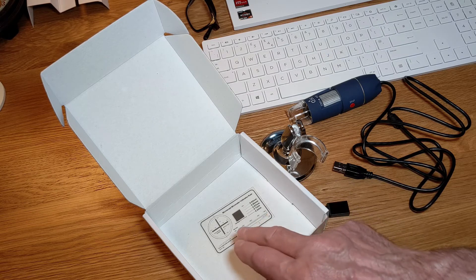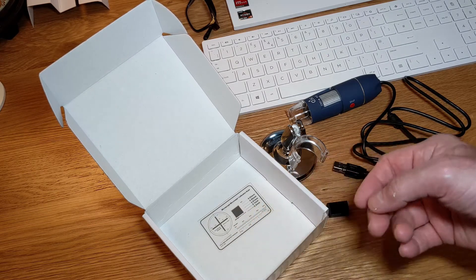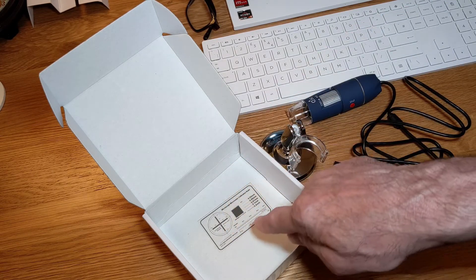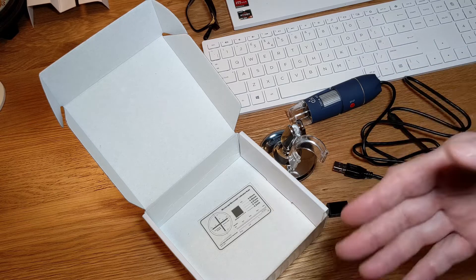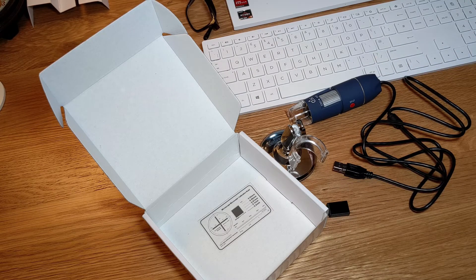It also comes with this microscope micrometer calibration ruler. There's nothing in the instructions at all or anywhere online that mentions it or how to use it. I think maybe it's just a thing where you hover this over and look at the millimeters and measurement rulers to see how far you're zooming in. Anyway, let's get this plugged into the PC and see how it goes.